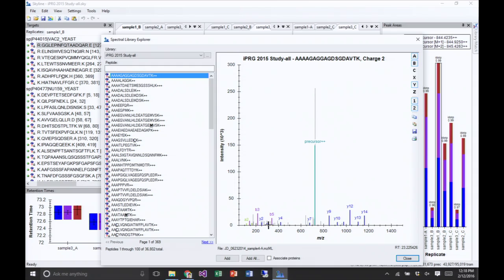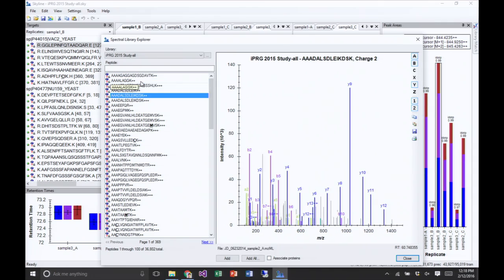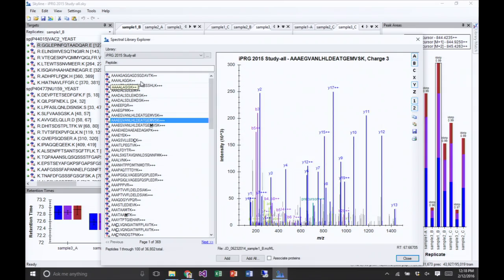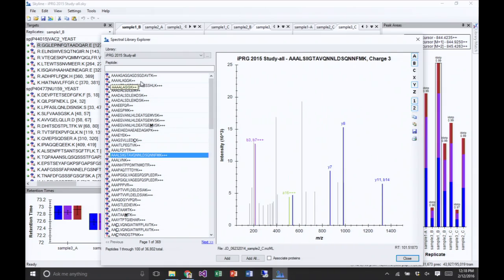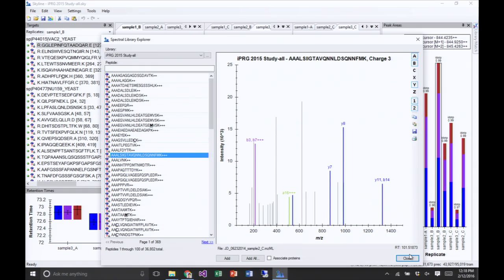So it's useful to check your retention times here, and to make sure that you have source files, because that's what's going to allow you to have those ID annotations. And then you could just run down through here and see that different spectra are coming from different files, and the retention times are jumping around within a reasonable range. So yeah, we can see this retention time is at 100, so we would hope that we have a 120-minute gradient. Yes? You seem to have this precursor ion there, Mark?